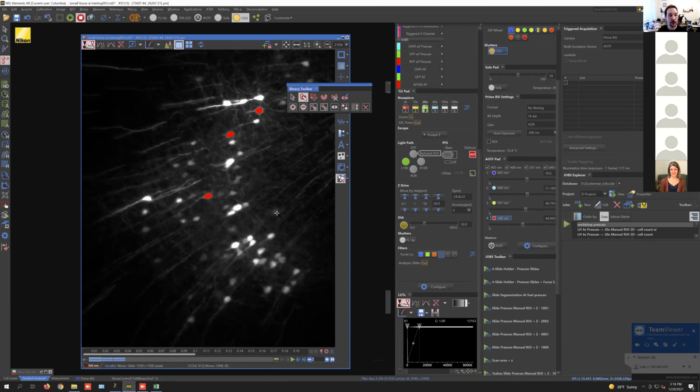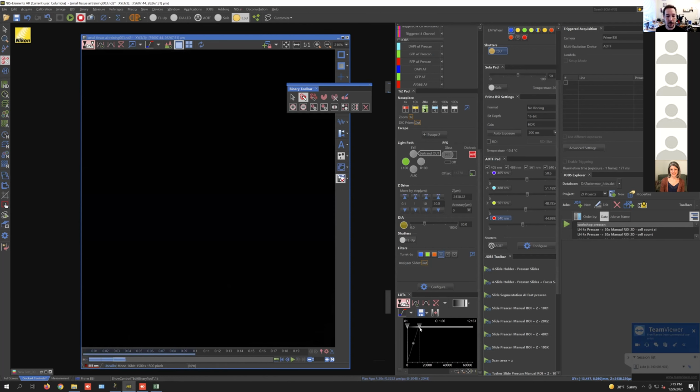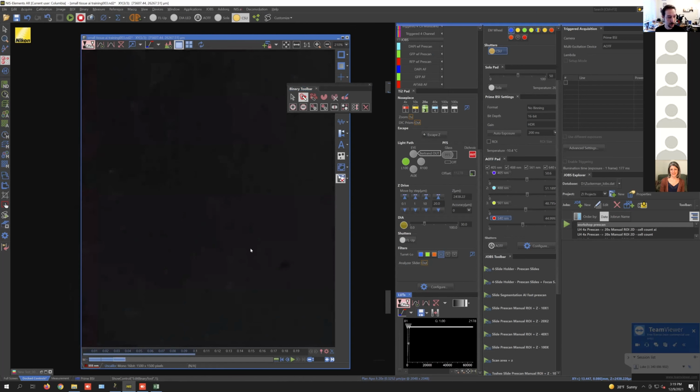And so at least if you sit down in one session and train this in a very consistent way, the results that you're going to be getting are going to be consistent and reflect that. So I think it's still a much better way. So this is what I would do. An important thing to remember is it needs to have mask information on every image. So if I had an image where I just had projections, like this is potentially a good example.